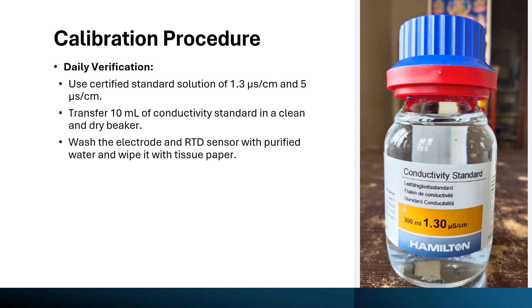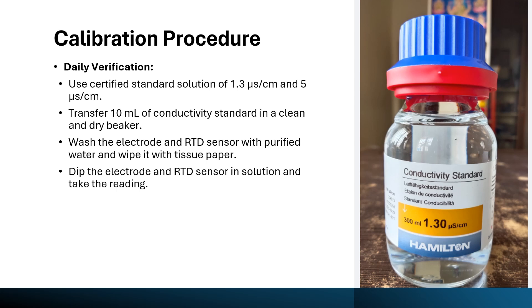Wash the electrode and RTD sensor with purified water and wipe with tissue paper. Then dip the electrode and RTD sensor into the 1.3 microsiemens per centimeter solution in the clean and dry beaker and take the reading. You can also take the reading for the 5 microsiemens per centimeter solution in the same way. The acceptance criteria for the reading should be plus or minus 0.2 microsiemens per centimeter.